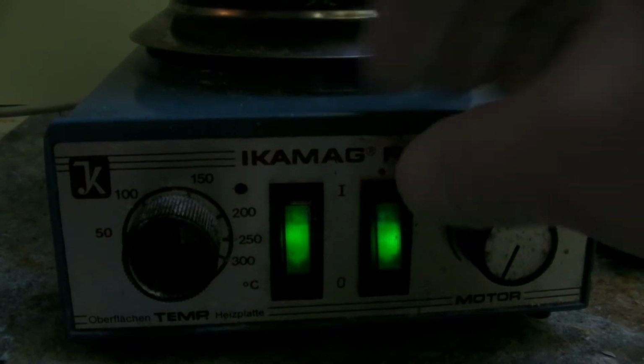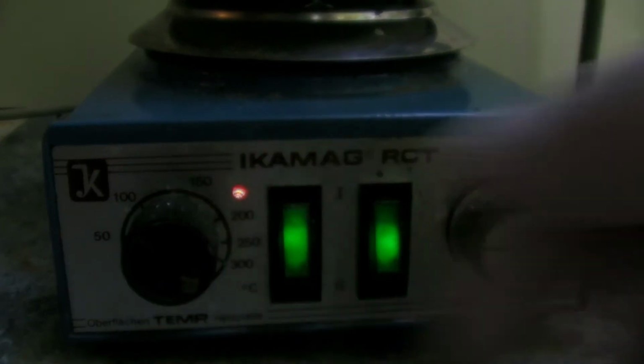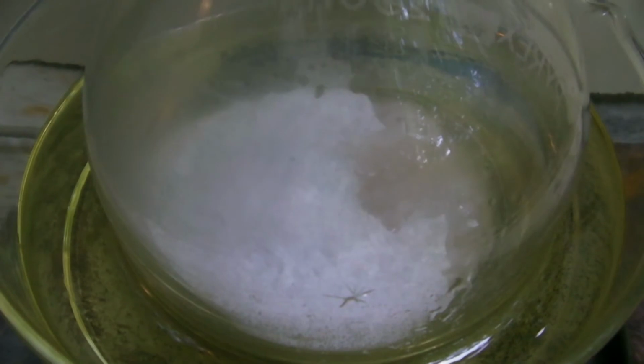The oil bath was heated up to 80 degrees C to heat the phosphorus pentoxide. Then the sulfuric acid was carefully added, and this is where I noticed the problem. The flask had a crack at this point, which could easily expand when it's heated.